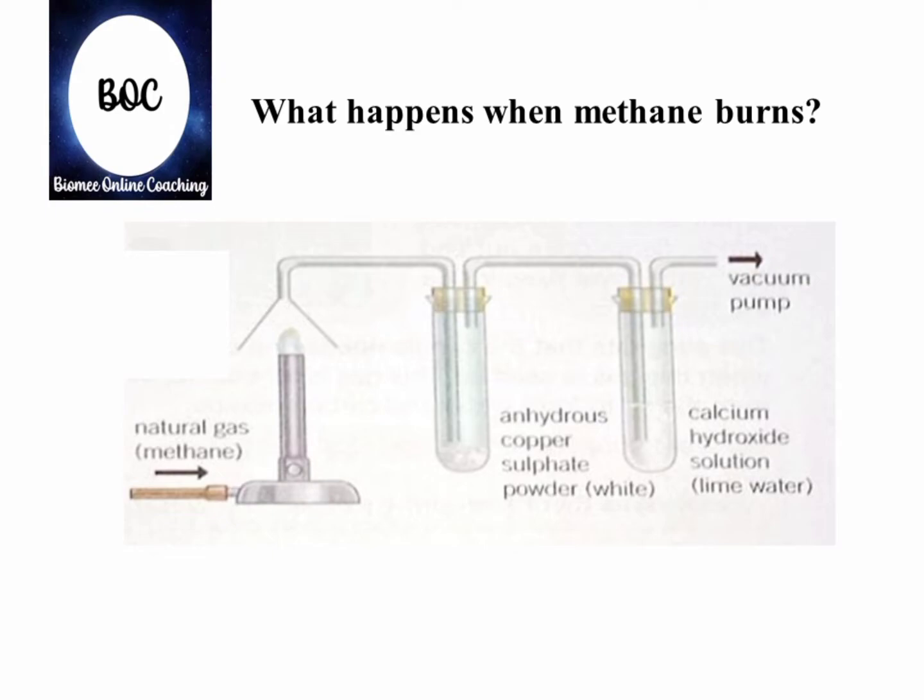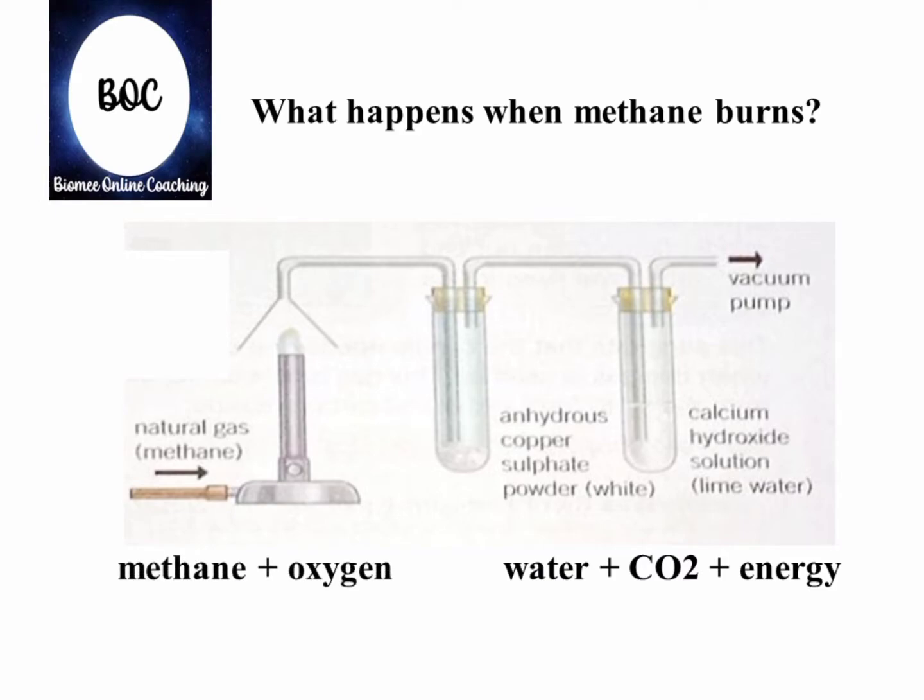Here the word equation is given below. When methane burns in the presence of oxygen, it converts into water, carbon dioxide and an amount of energy.